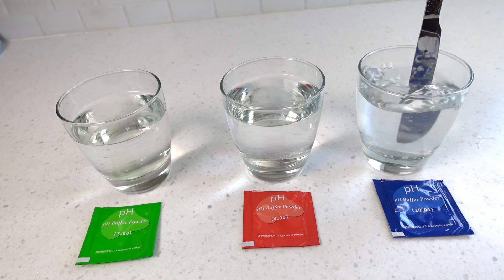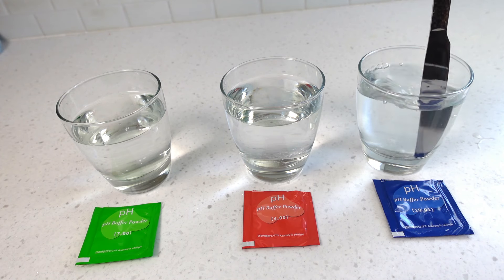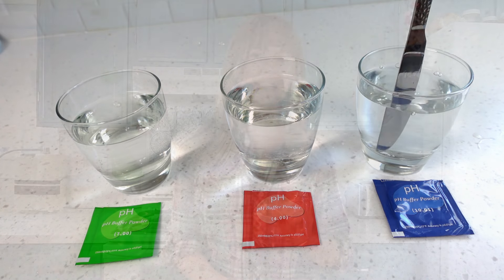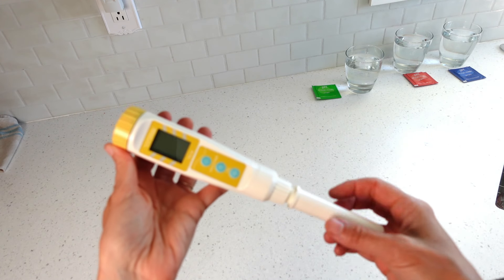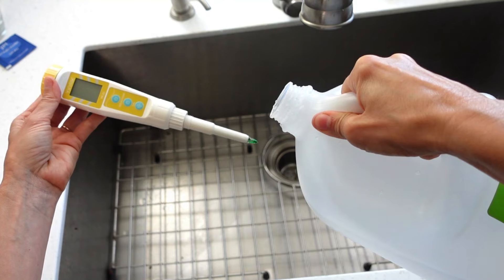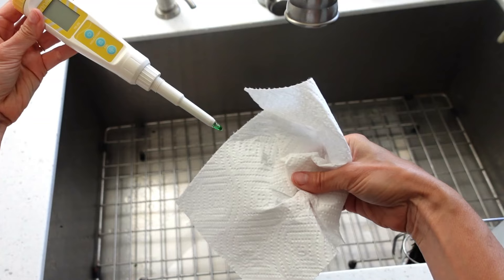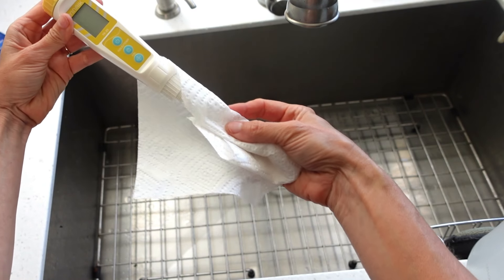You may notice that during the demonstration my meter reads near the exact correct pH before you see me calibrate it. This is because my meter is not brand new — it's already been calibrated before its first use some time ago. Today I'm going through the entire process again for the benefit of this calibration demonstration. Remove the protective cover by unscrewing it. Rinse the meter off with distilled water — no soap and sponge needed. Then very gently dry the probe with a clean paper towel.